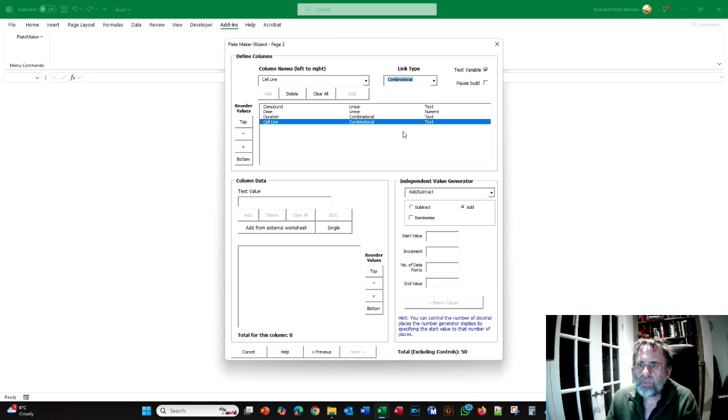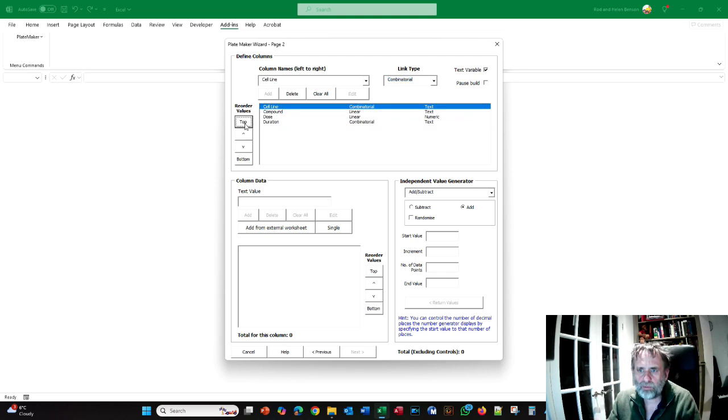So remember, in terms of our grouping variables, we want cell line therefore most grouped, so it needs to go to the very top of the table. And we also want duration grouped as well, above compound, but probably below cell line. So let's just move it up here. So now we've got our two new variables.